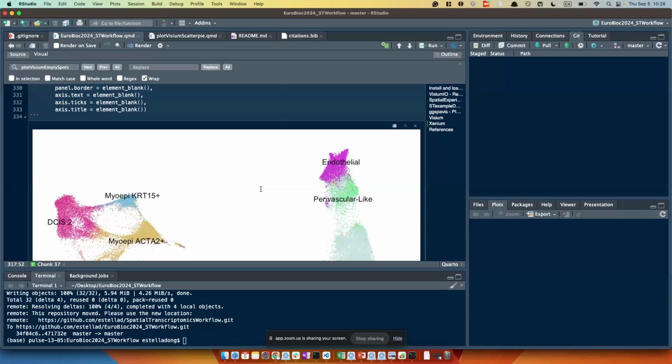Yes, sounds good, because I think one of the problems with such fancy projects is bandwidth. You said you're now waiting for that part. There's SpatialExperiment, Voyager, a lot of different players, so I think the impact of the book would be much better if we all sit together and try to be as inclusive as possible.